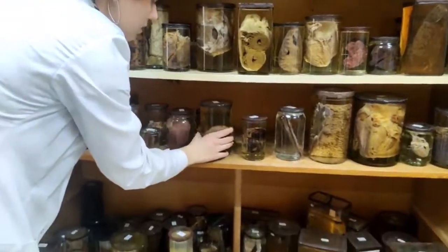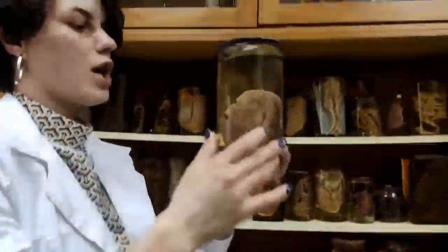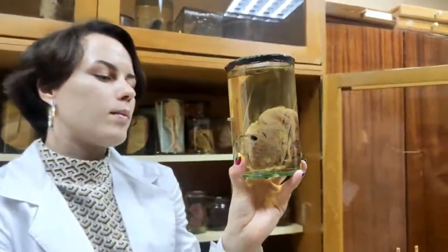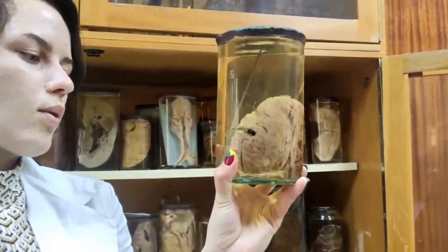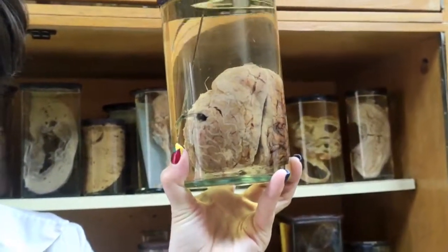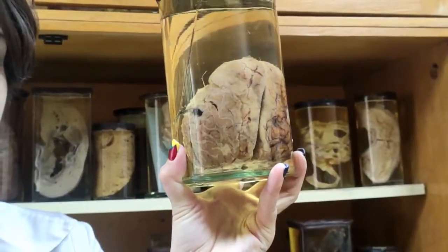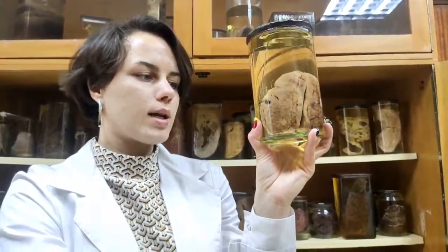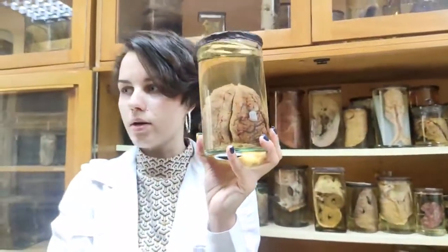The next one is the brain in meningitis. Meningococcal infection can manifest in different ways. The first one is meningococcal nasopharyngitis. It's, I think, a more simple and not very dangerous form of meningococcal infection. The second one is meningitis. It's a bacterial infection, and Neisseria meningitidis is the etiological bacterium of this process.